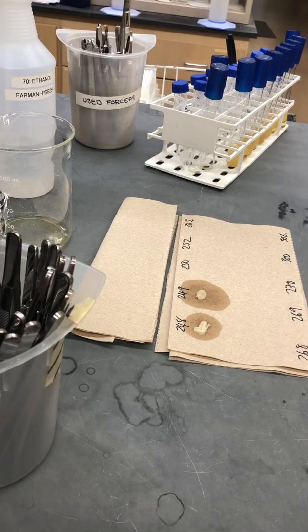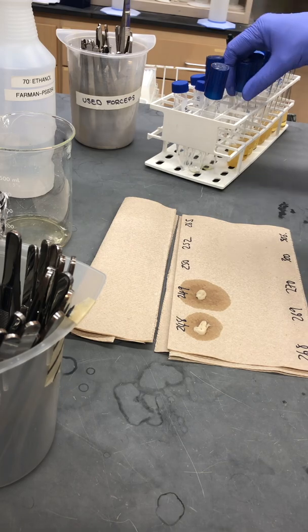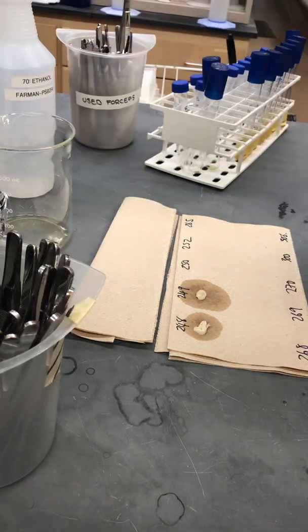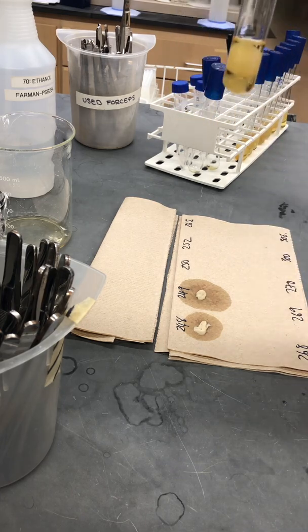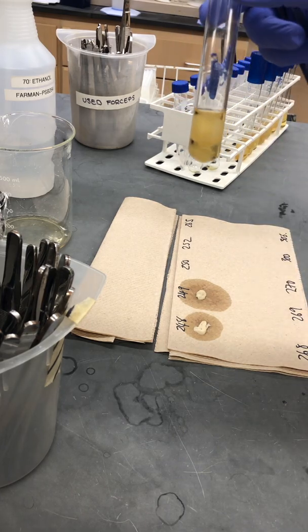This is a quick video just to show how we quickly process fungal mycelial samples for DNA extraction. We'll grow the cultures in 10 mils of complete medium for seven days.